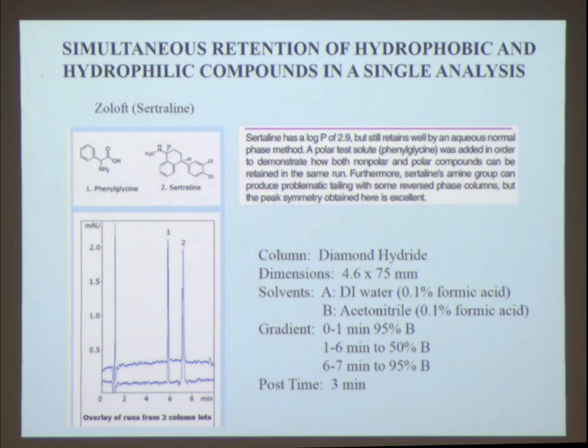But again, if you calculate the hydrophobicity of the two, sertraline has a log P of about 2.9. And this is done still with the fact that it has longer retention than phenylglycine. So it's an interesting combination of the two.